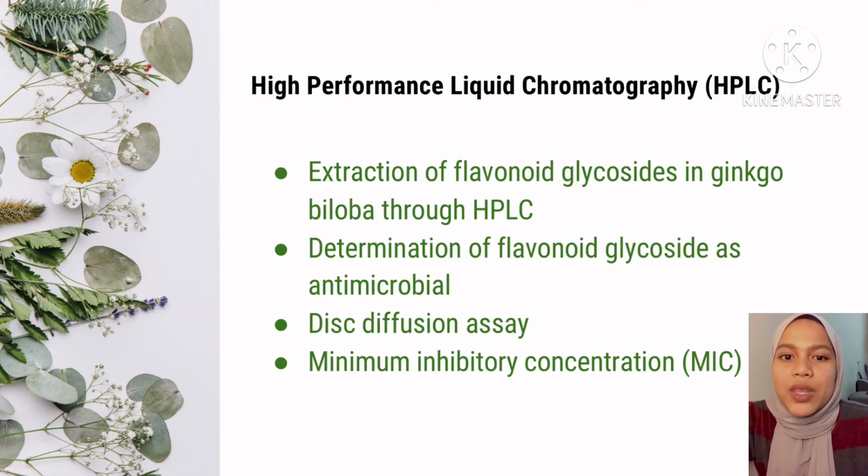Next is minimum inhibitory concentration (MIC). Following the Clinical and Laboratory Standards Institute methodology, the MIC of Gingko leaf extract was determined.